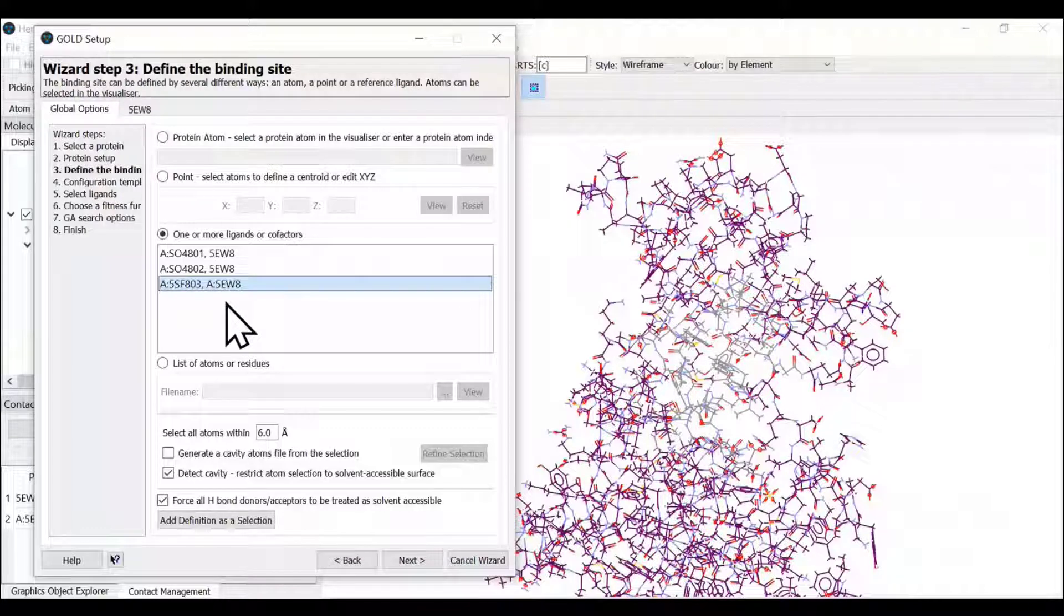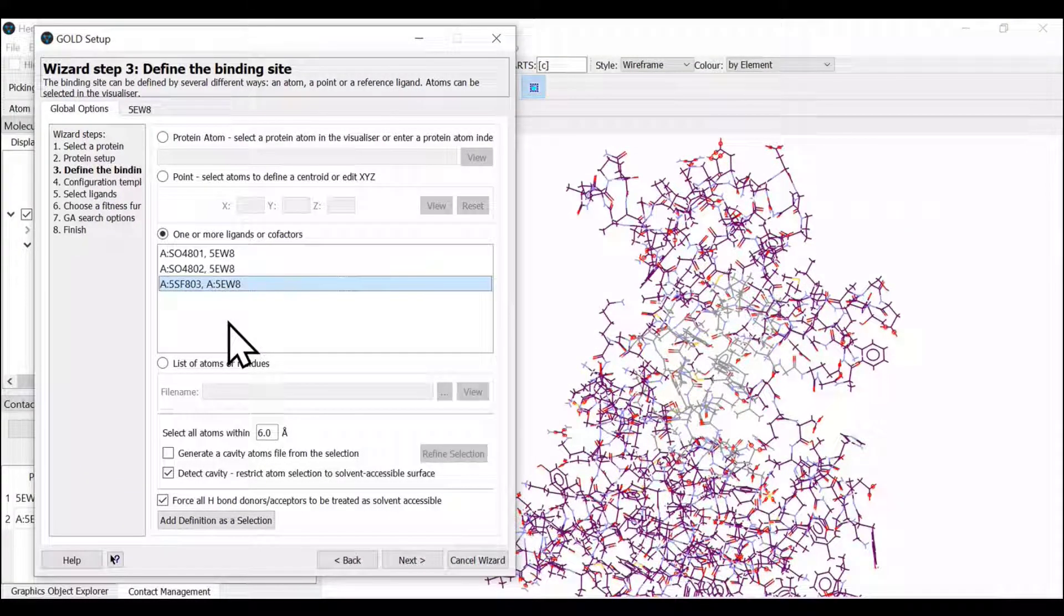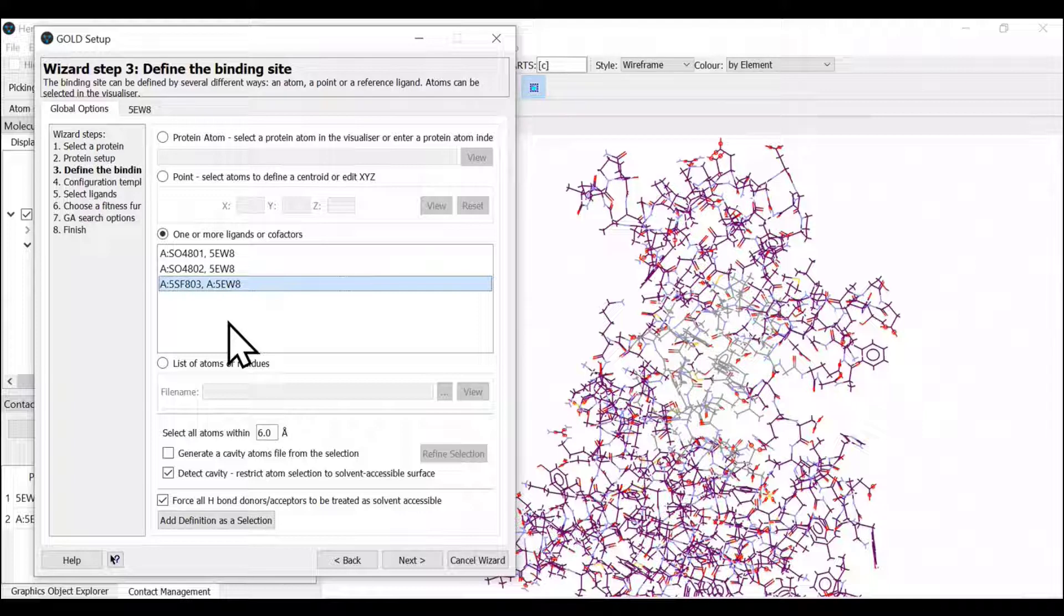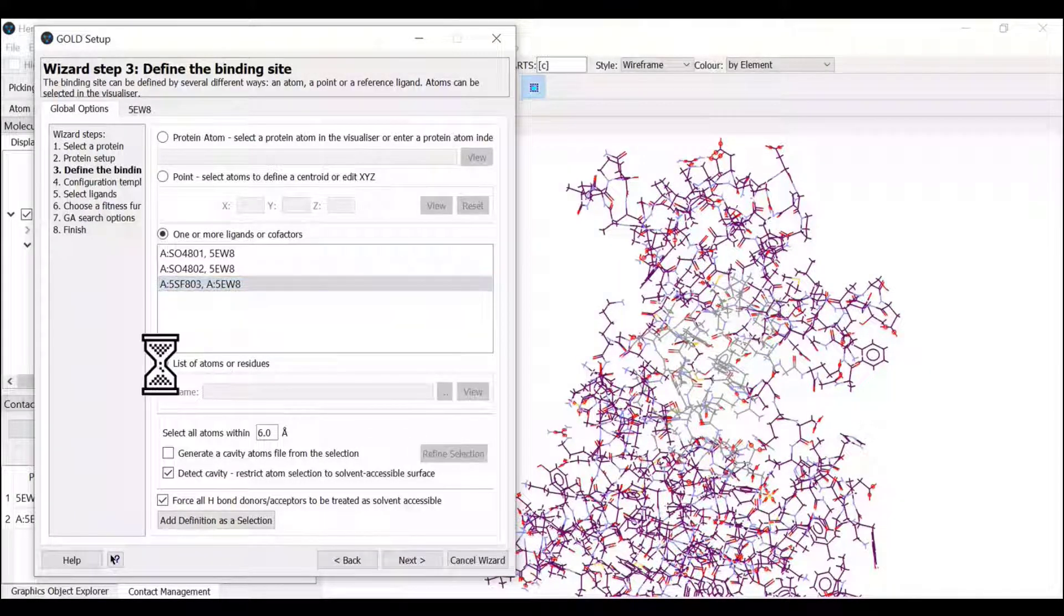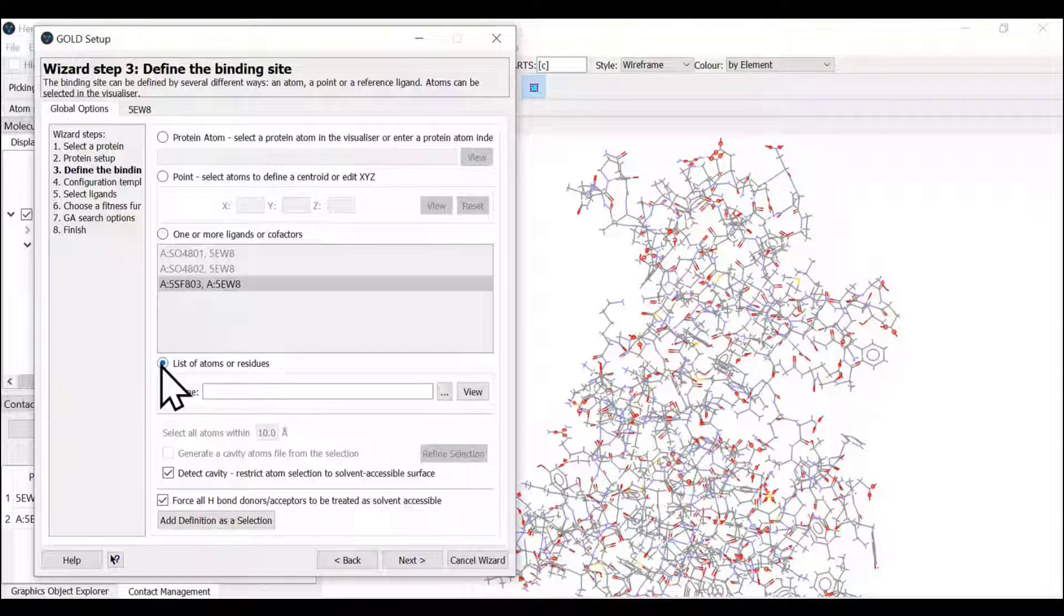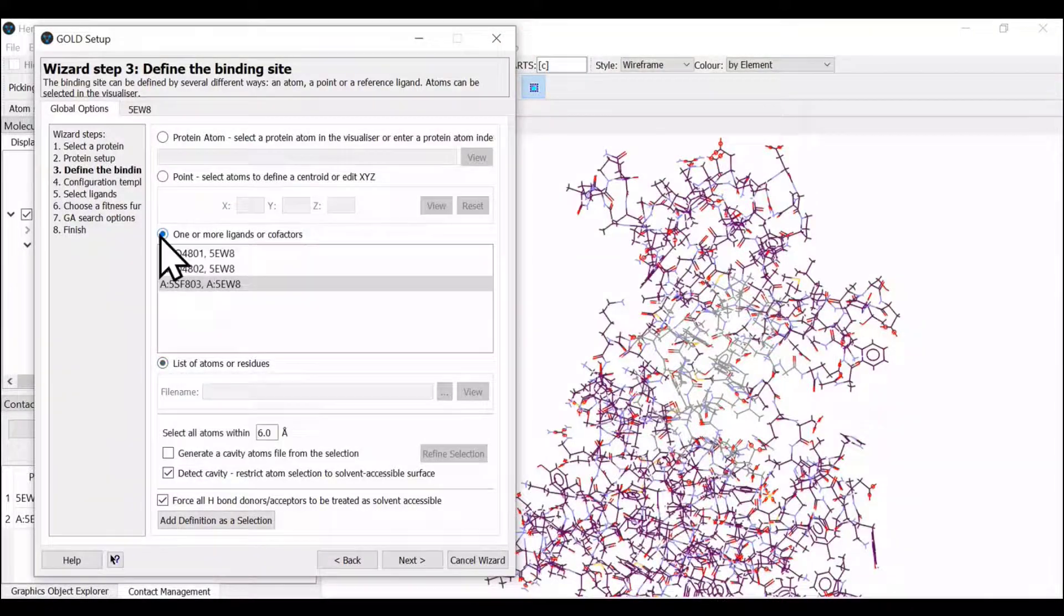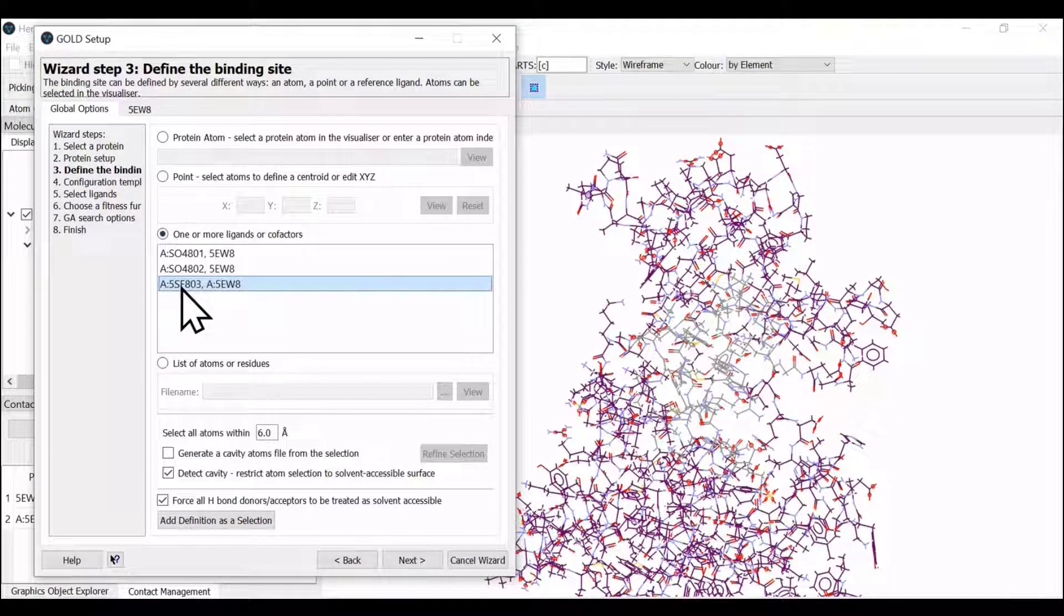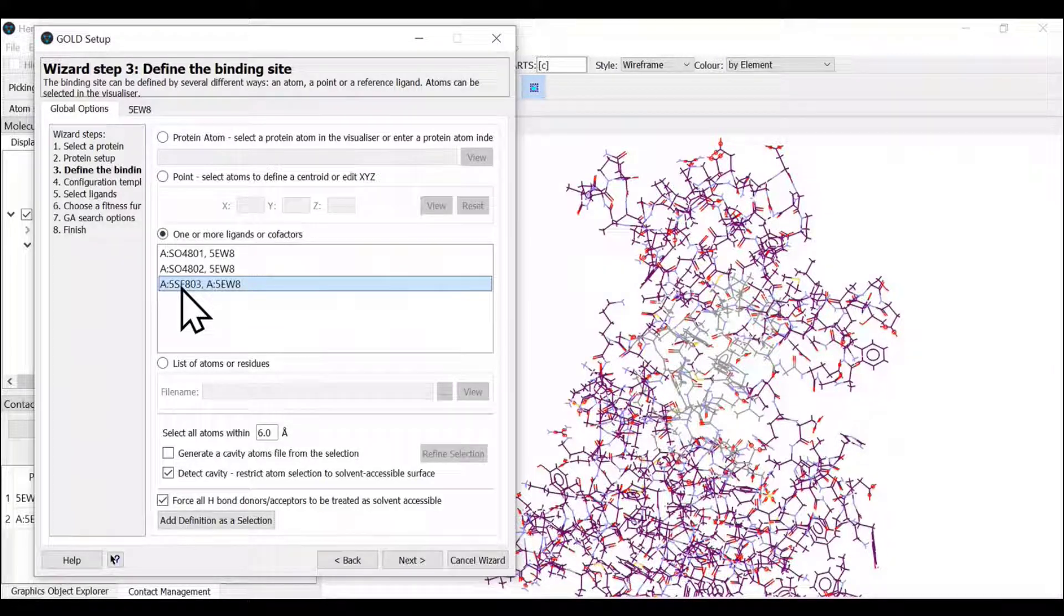In our case, we have a reference ligand bound in the active site or binding site, so we're going to select this ligand. If you don't have any of the above three options available, you can list out the items you wish to see interaction with. Let us go with our most favorite one—we have a ligand bound to the receptor.